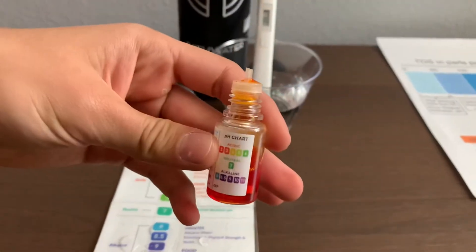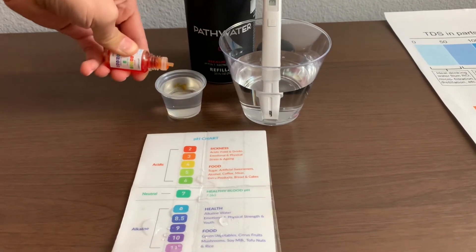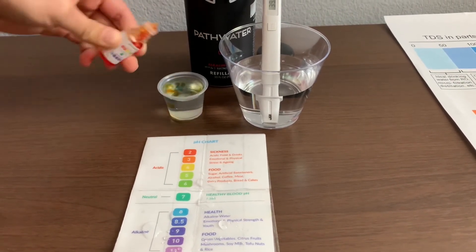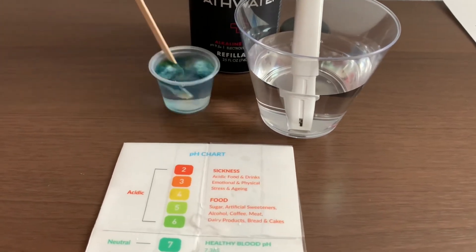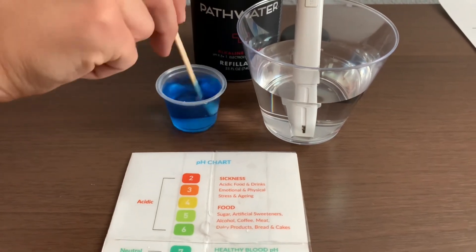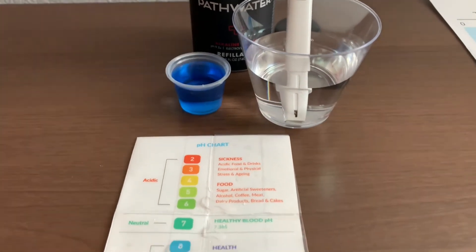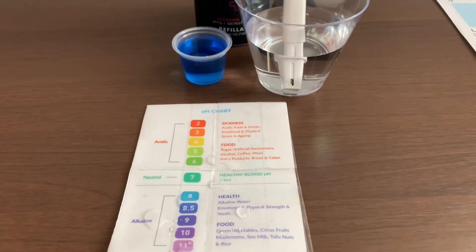Now let's test the pH level. Make sure you only do two drops. Let's stir it for a better result. I give that an 8.5 — that is alkaline water.